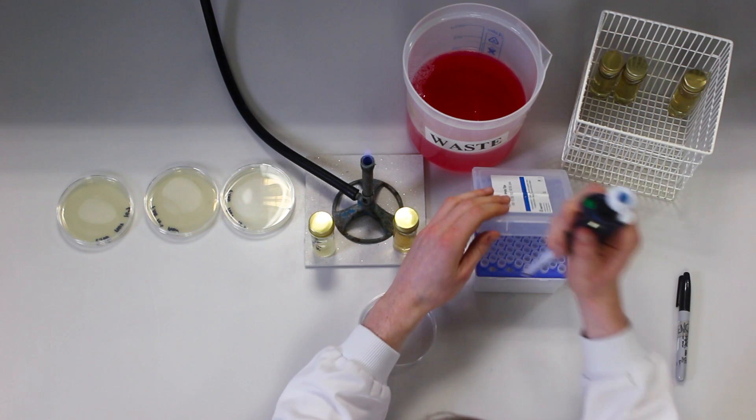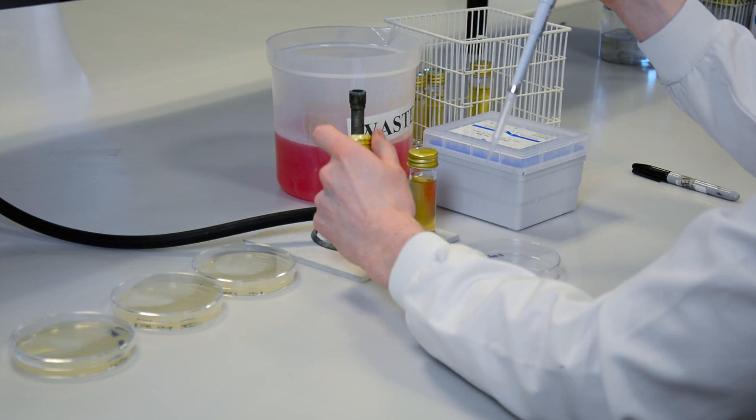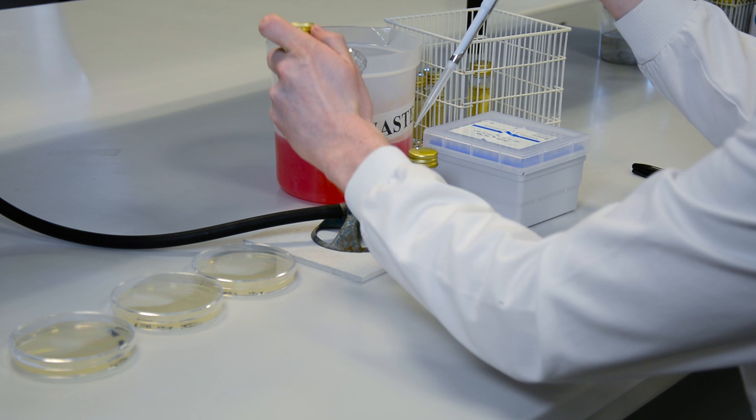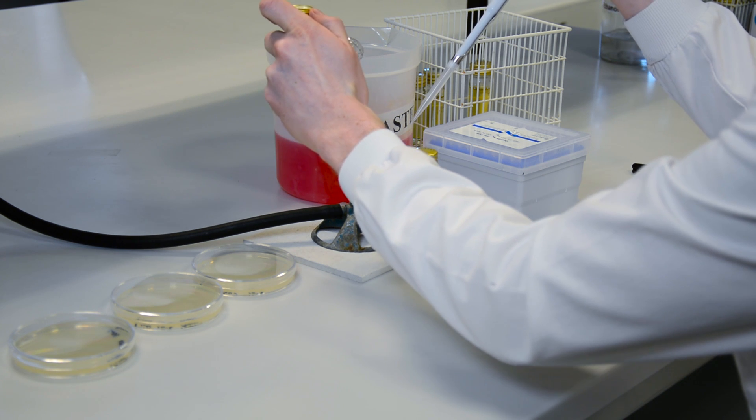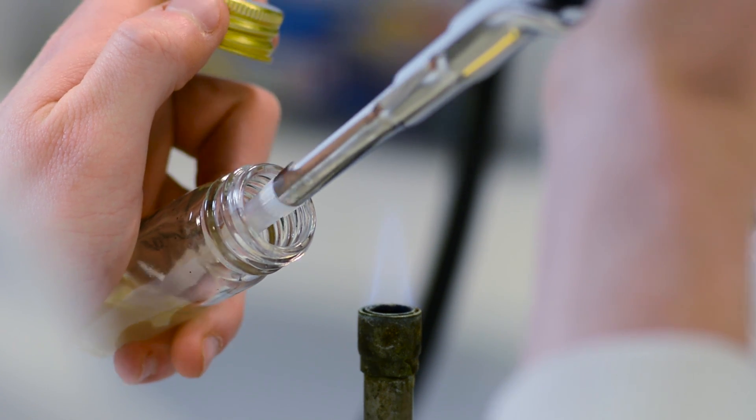Working close to the Bunsen as usual, an inoculum is added to the agar using aseptic technique. With this method an inoculum as great as 1 milliliter or 1000 microlitres can be used, which is 10 times that usually used for spread plating.